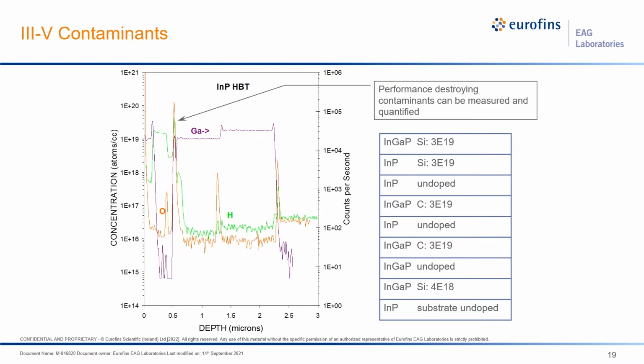We see a high hydrogen concentration under the carbon-doped base layer, as well as the silicon emitter layers at top. So by monitoring the gallium and the location of these peaks, you can have a good failure analysis of where the epitaxial growth is having problems.